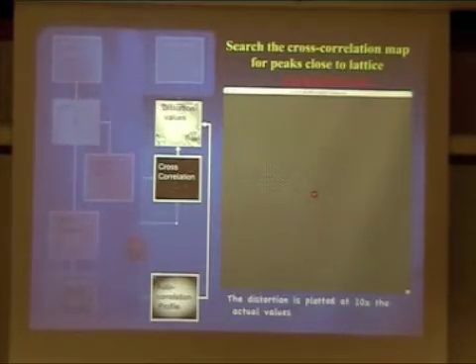That has to do with the way they do the search. The way they do the search is that they move by one unit cell in the search around. Okay. In other words, you are ignoring the ones that are off by a lot, the correct positions. So you miss the spots.